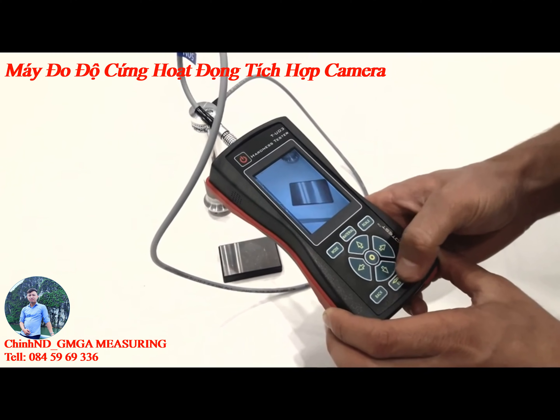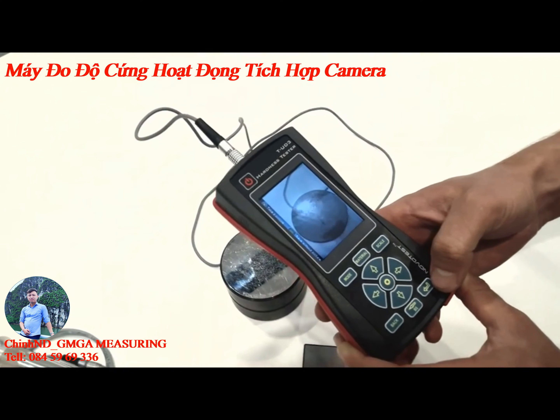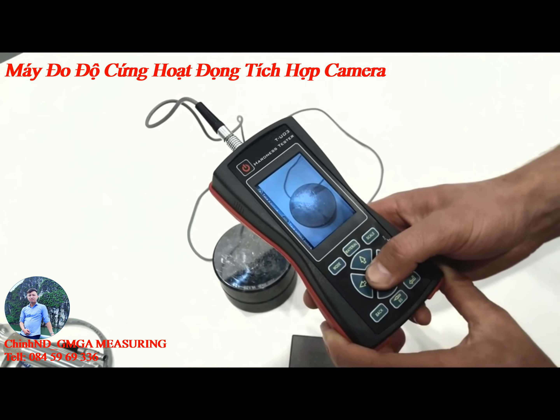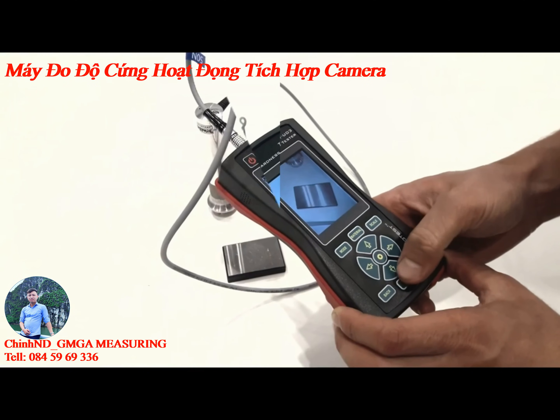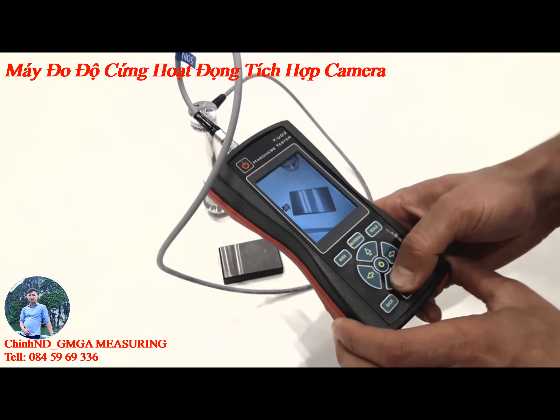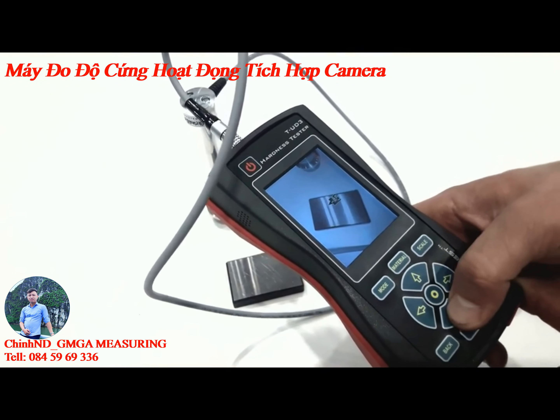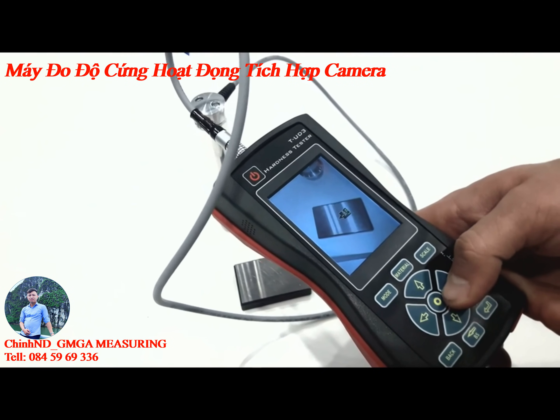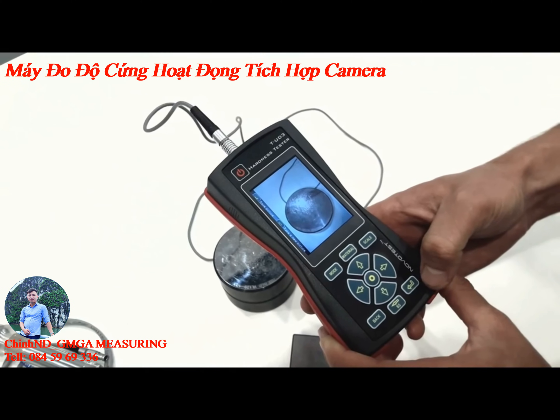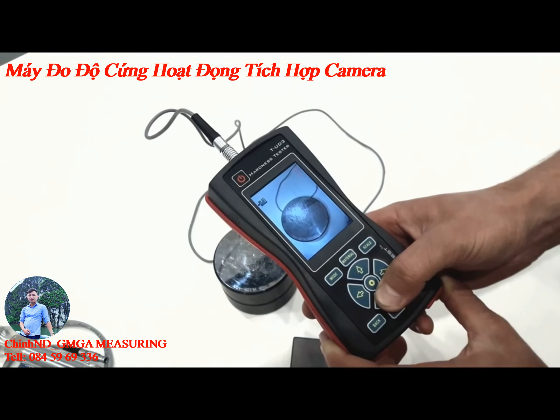Shoot the tested object. Then, place the markers at those places where your measurements took place. What a simple and convenient way to present your work.